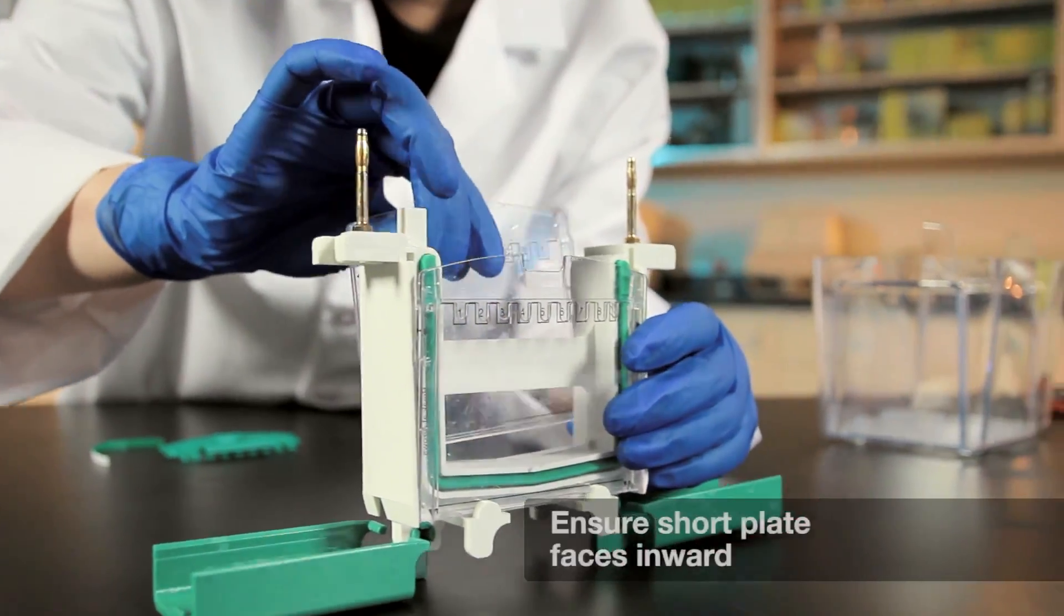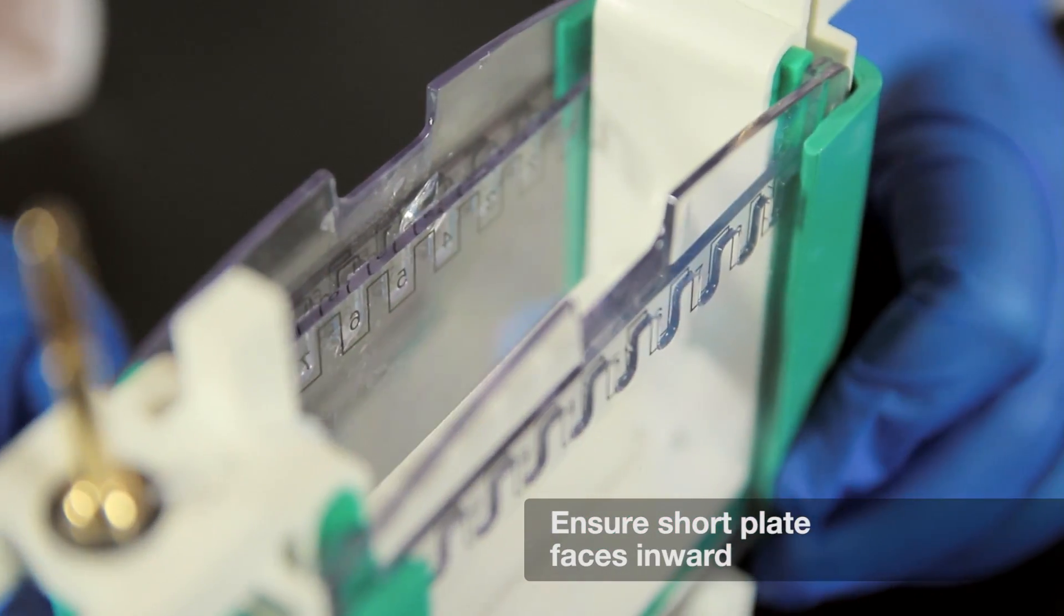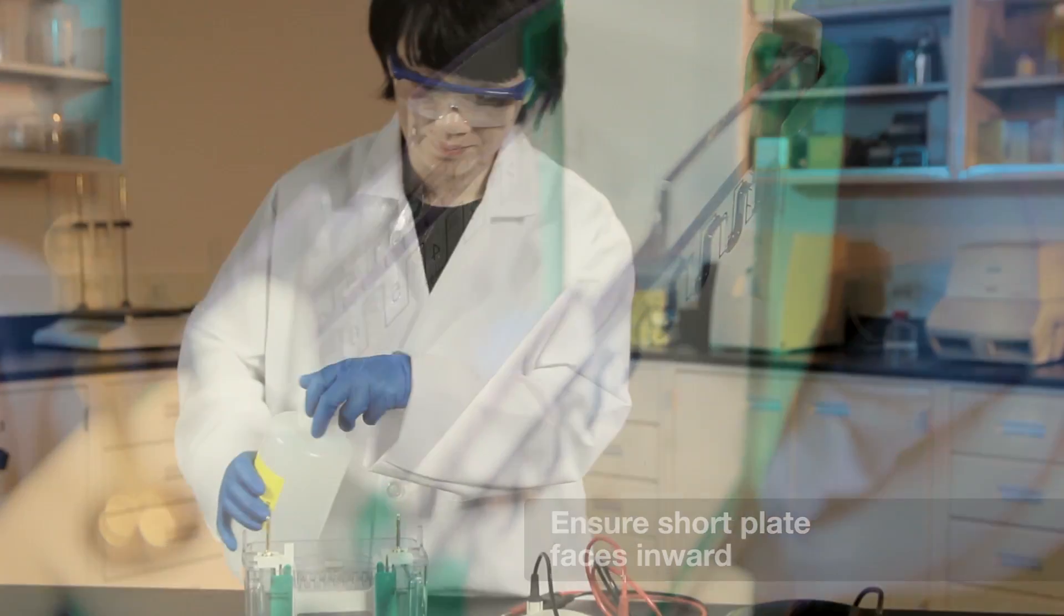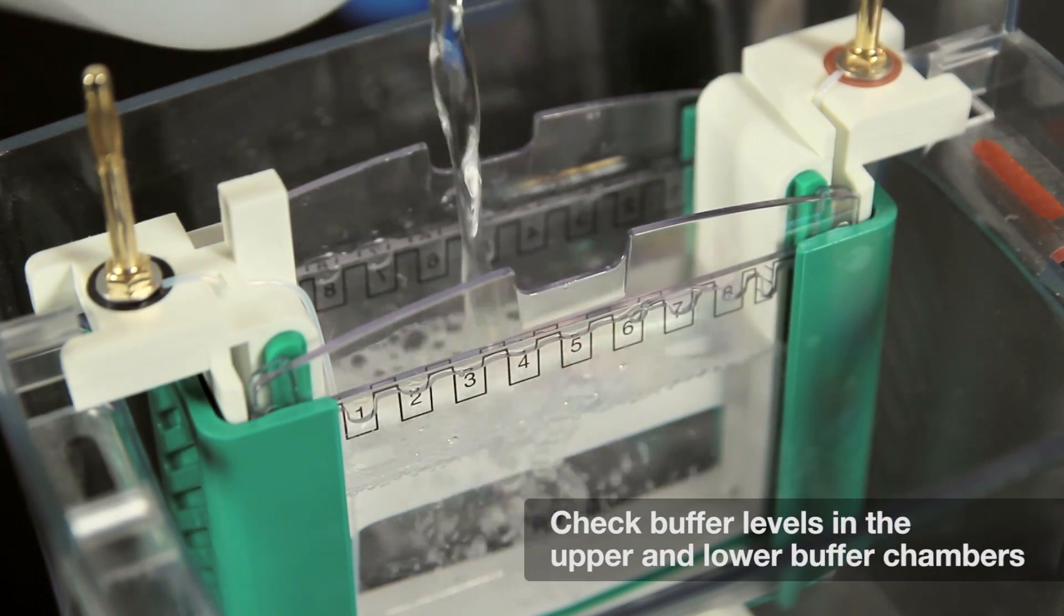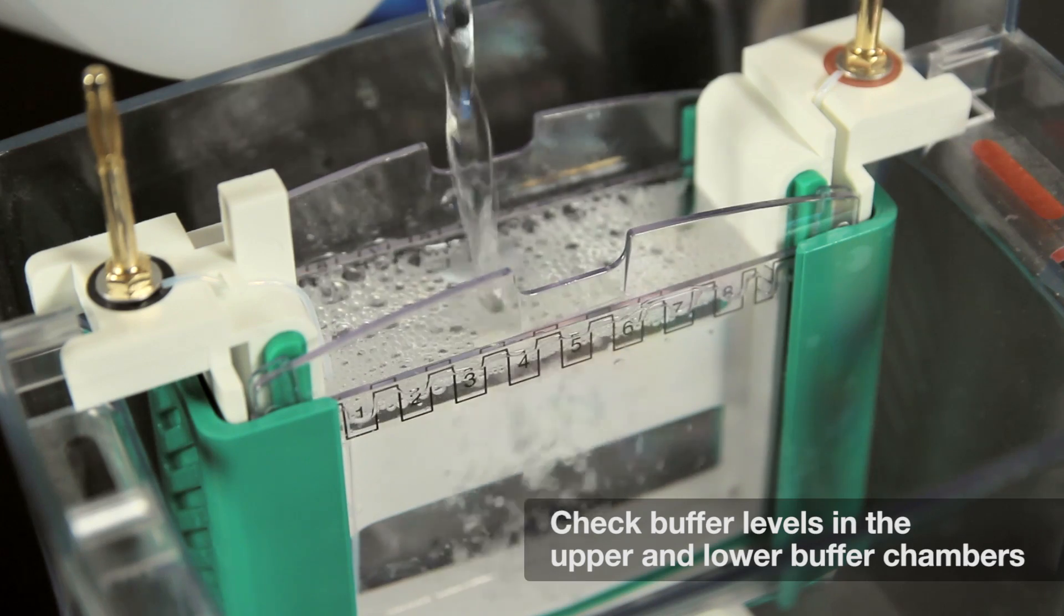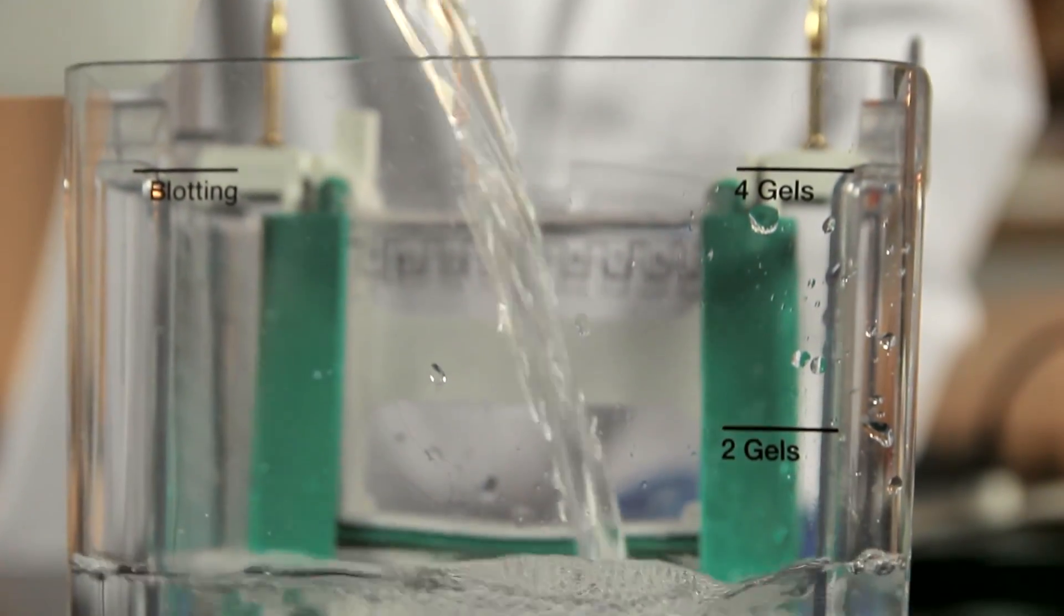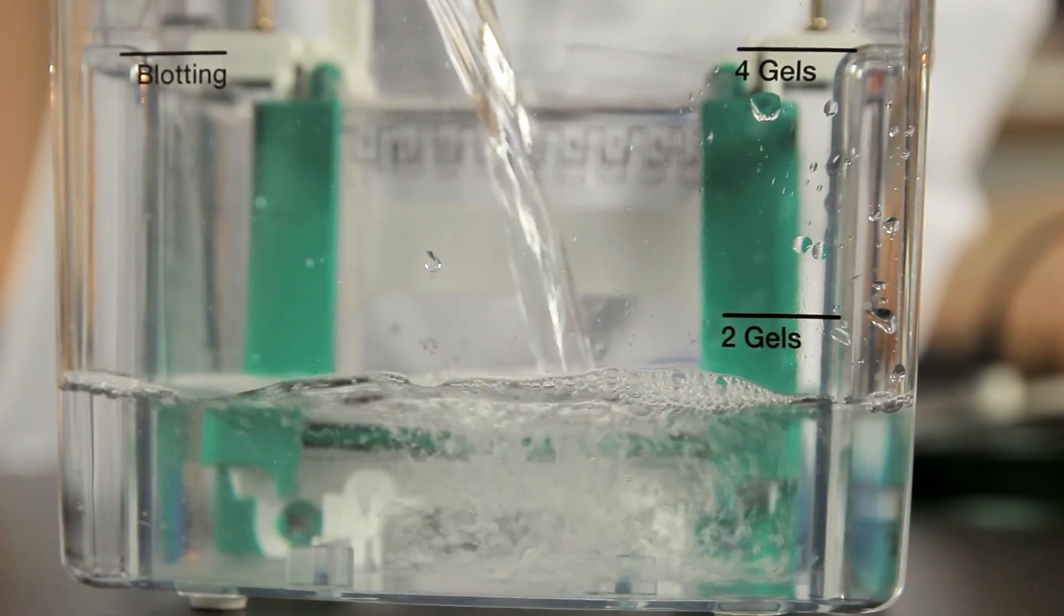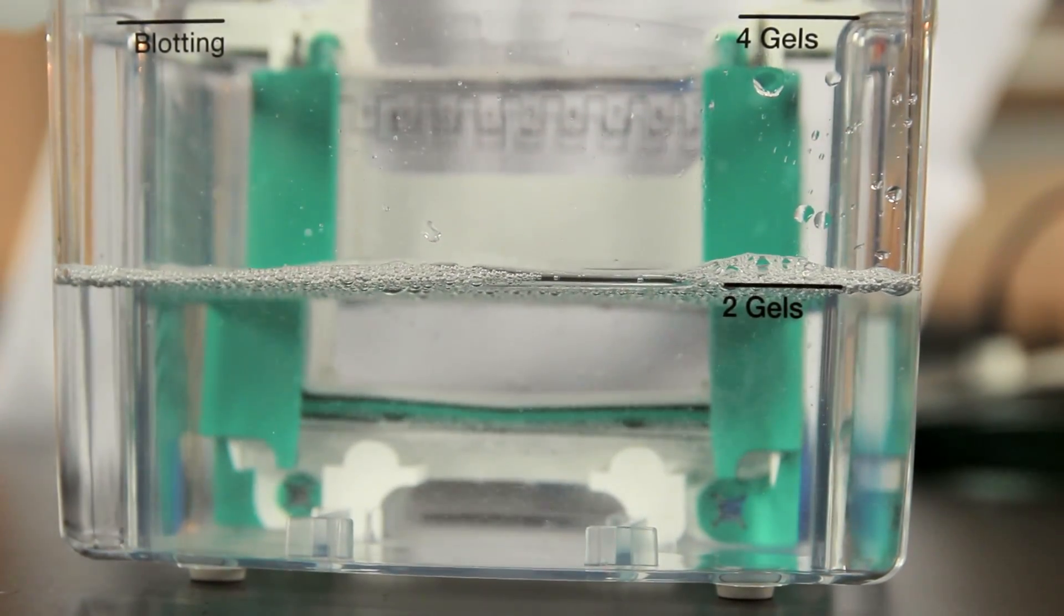Next, it is very important that the short plates face inward towards the upper buffer chamber in order to complete the circuit. Another common problem is an insufficient amount of buffer. We recommend the upper or inner buffer be filled all the way to the top, and the lower buffer be filled to 2 to 3 centimeters above the bottom of the short or inner glass plate gel. If the buffer level is below the plate gel, the circuit will not be complete.